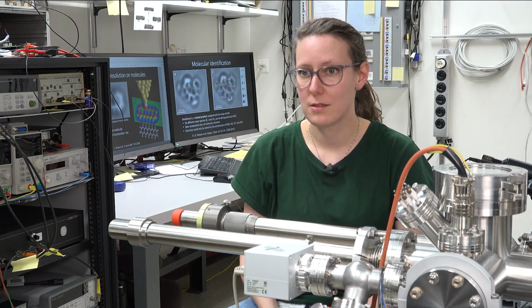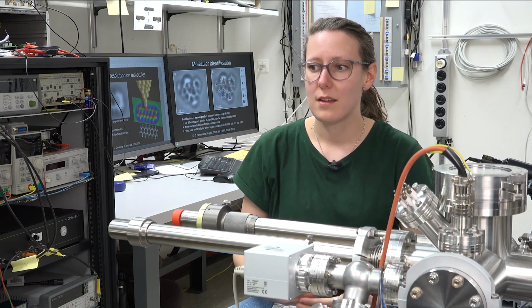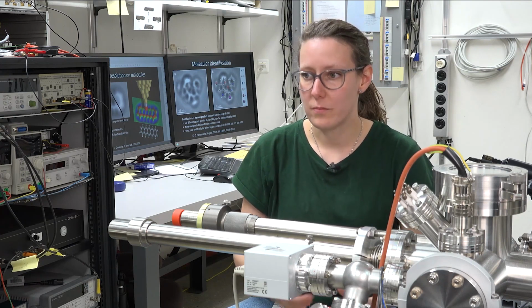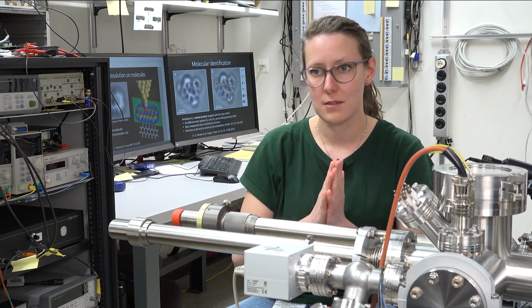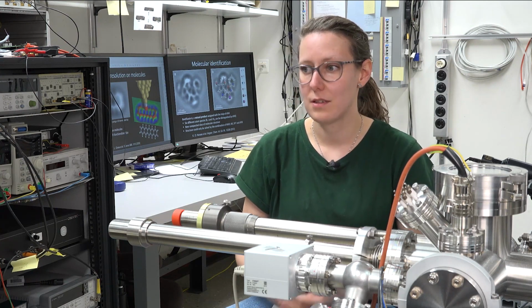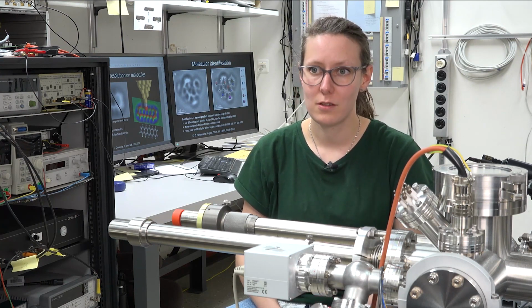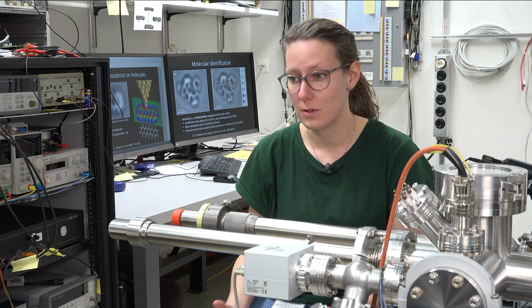So we collaborated with chemists from the University of Santiago de Compostela, and they extracted some fraction of this meteorite powder to really extract more molecules that we can actually resolve with our technique. And with that, we increased the number of molecules during one measurement run that we could actually resolve with that technique. So that was one part.